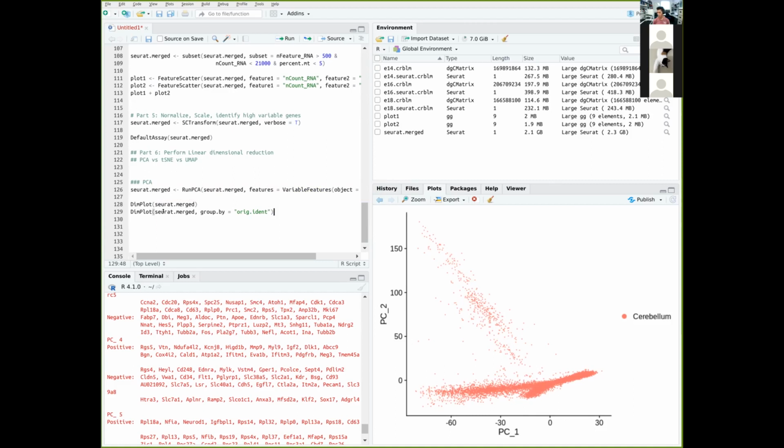It's a short question. In my plot, on the y-axis, I have 0 to minus 150. So you have 150 to 0, and on my y-axis it's 0 to minus 150. Yeah. Everybody, I know there's a reason for it, but who else has this inverted scale? I have the same. I see.